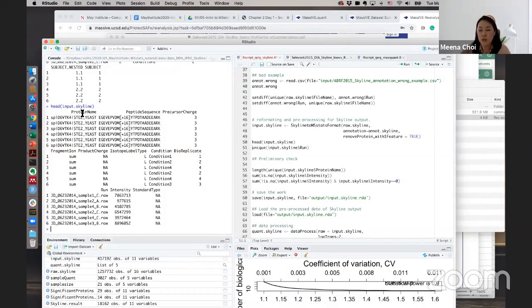This is the basic analysis using MSstats, which Olga briefly mentioned. We are also working on MSstatsPTM. It will have a very similar workflow, but conclusion-wise it will be a little different. We are working on it, and hopefully we can finish by the end of this year. Okay. This one I also answered.